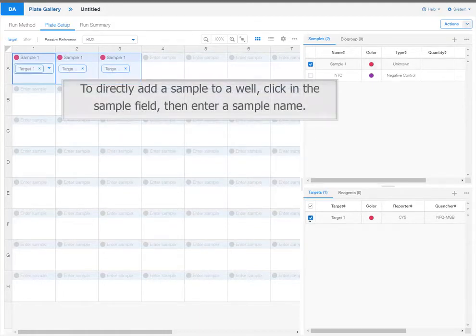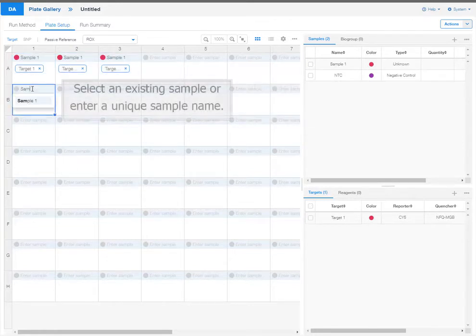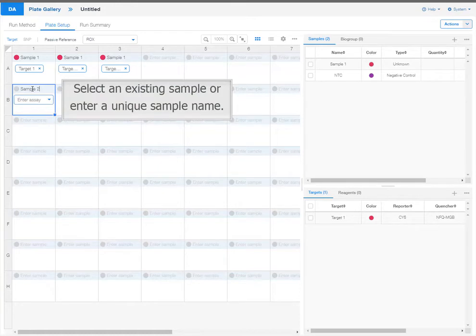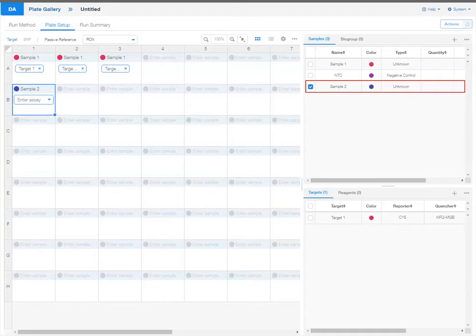To directly add a sample to a well, click in the sample field then enter a sample name. Select an existing sample or enter a unique sample name. The new sample is added to the sample table.